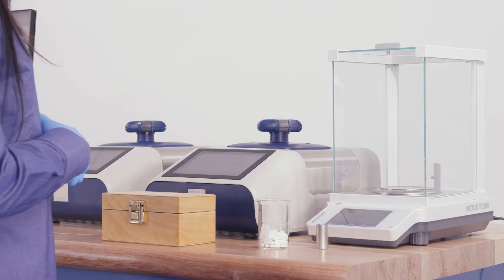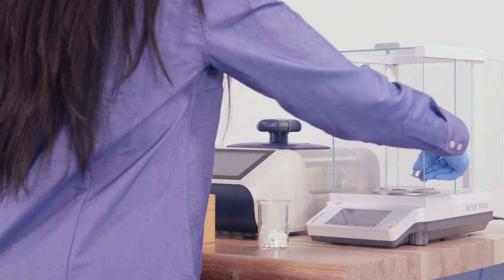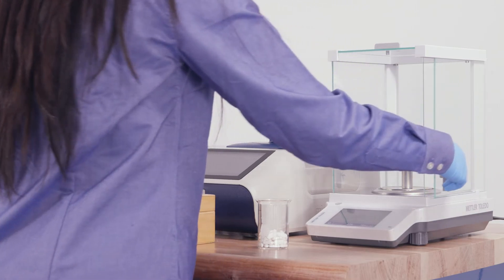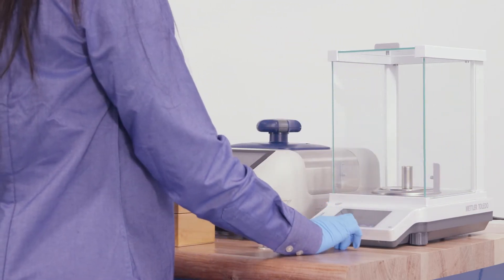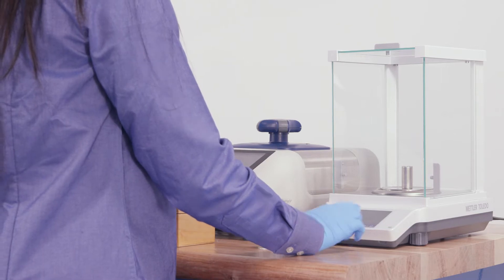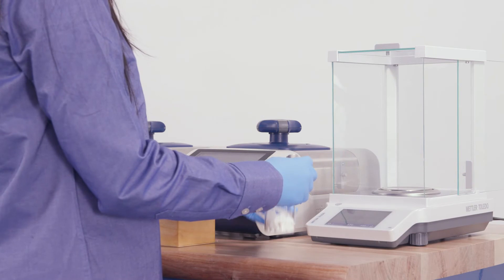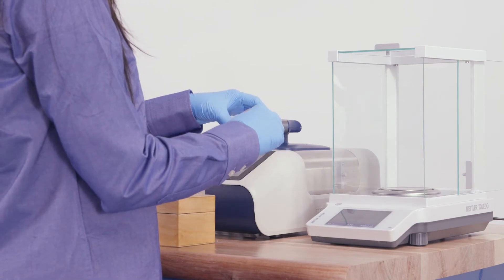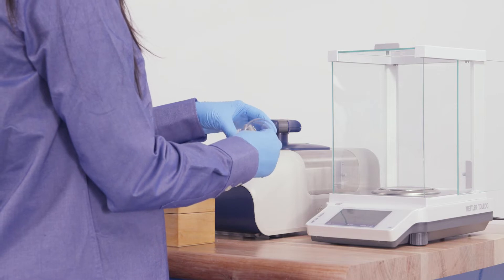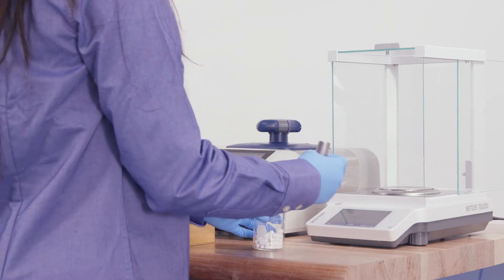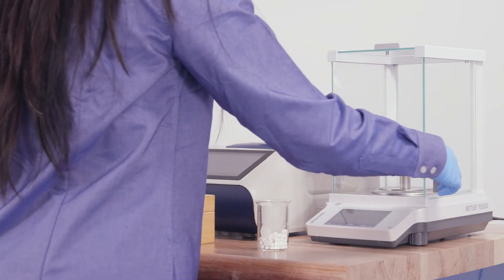But first let's start by loading the sample. We'll place the chamber on the balance and tare the balance, and then put the sample into the cup and weigh the sample.